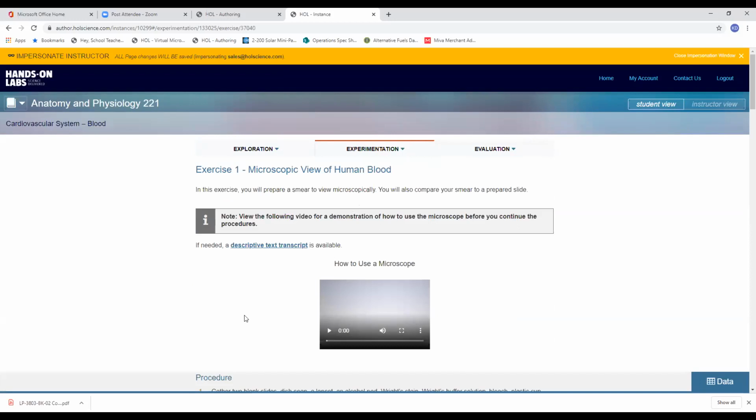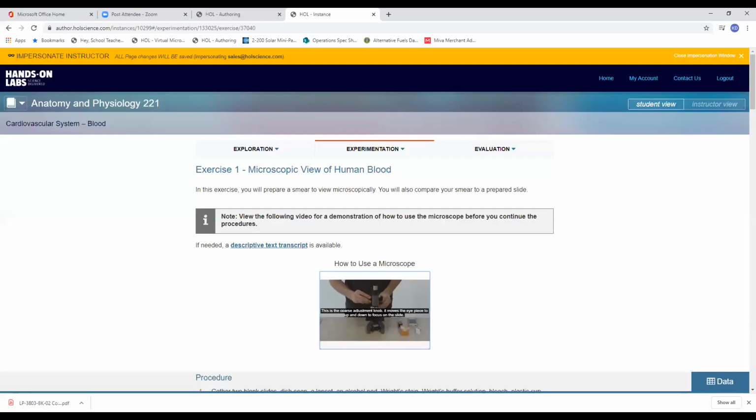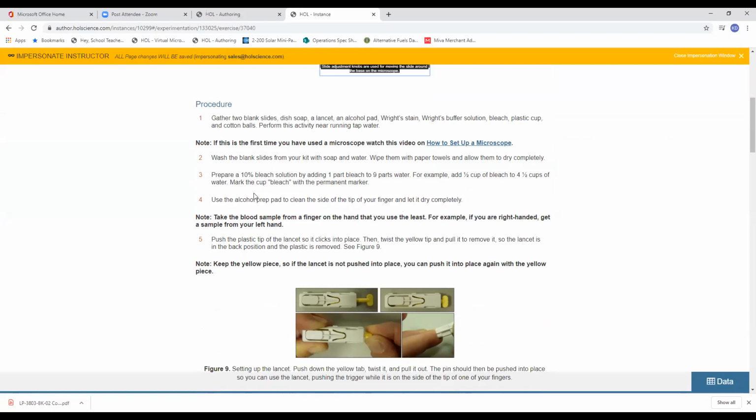Now, throughout our procedures, whenever possible, we do include videos of standardized lab procedures. So, for example, if we have an experiment that requires microscopy, it is going to coincide, and I'll mute this, it's going to coincide with our microscopy video to assure that in this instance, for students using a real microscope, that they get a quick refresher on basic operating principles of a microscope. Once a student has viewed any of the requisite videos, they are ready to begin the procedures.